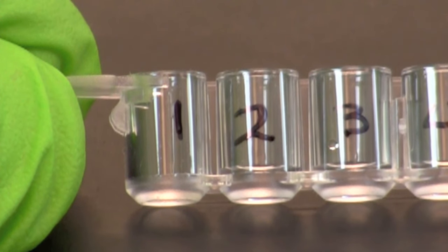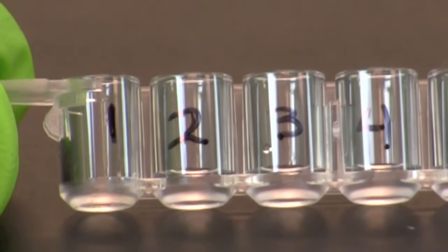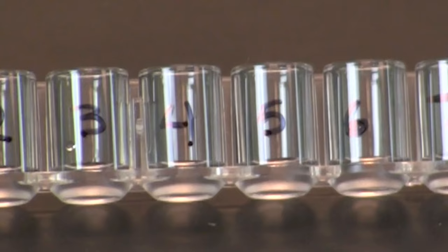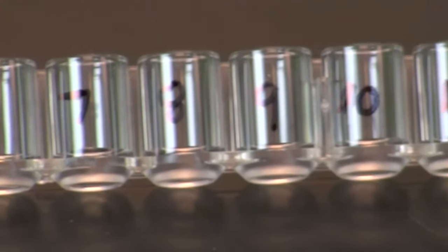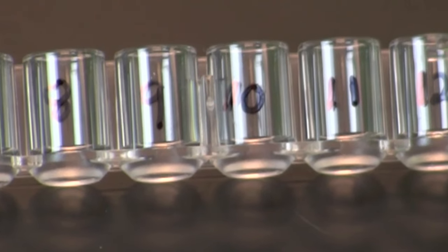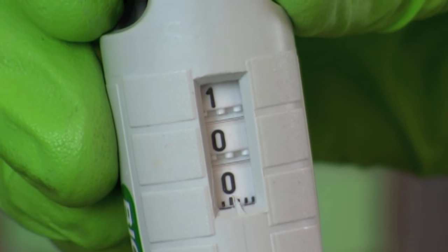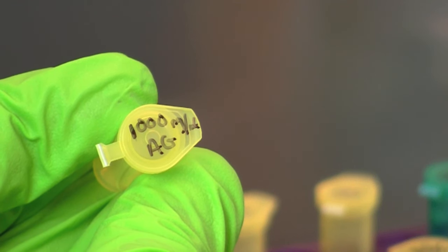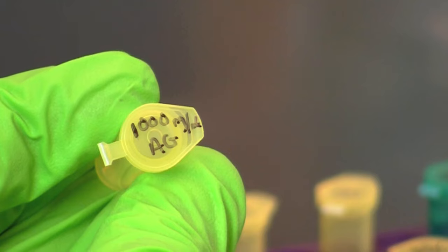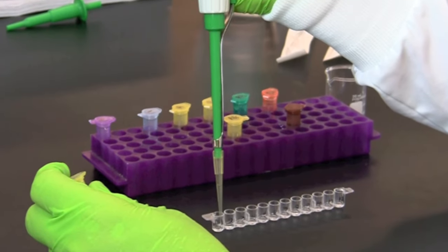In the first microplate strip, pipette 50 microliters of 1x PBS, or phosphate buffered saline, into wells 2 through 12. Do not put any PBS in well number 1. Set your micropipette to 100 microliters and add 100 microliters of 1000 nanograms per mil of antigen to well number 1 of the first microplate strip.